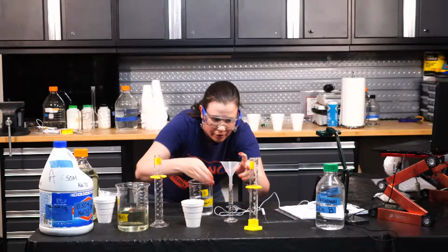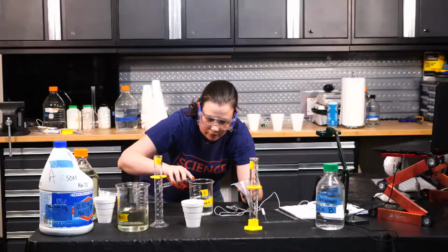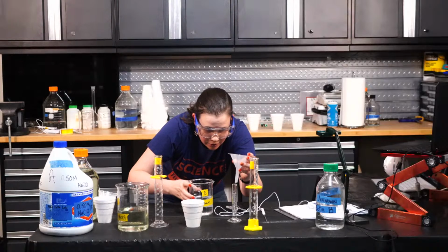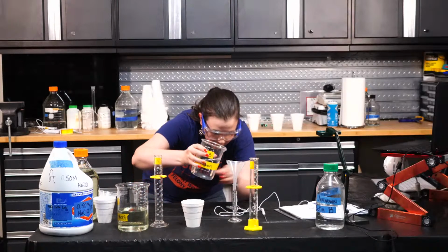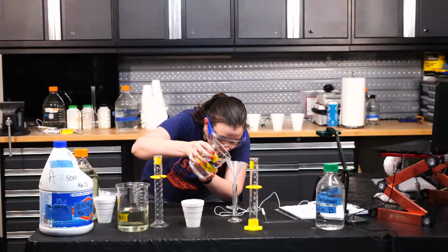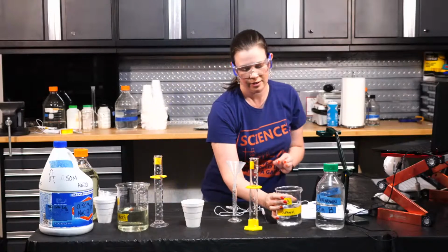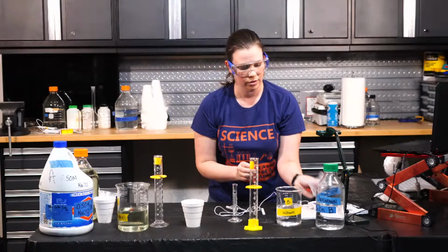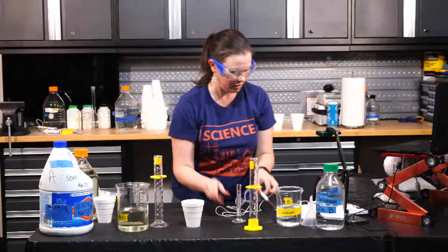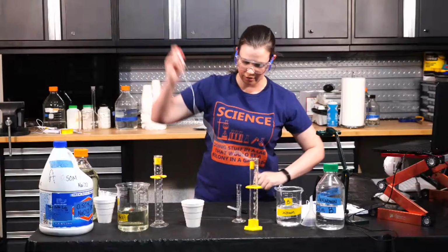Oh, I went a little bit over. Let's try that again. All right. So now I got 5 milliliters in. Let's get our baseline temperature ready.